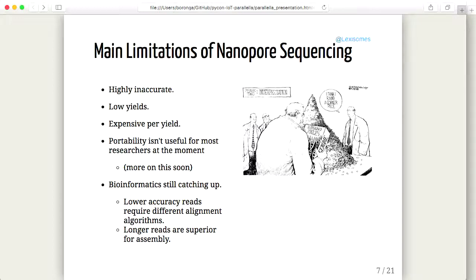I've put this picture here of a jigsaw puzzle. When it comes to assembling back a human genome, you have all these really short strings of DNA and you want to put them all together. The human genome is 3 gigabases, so it requires a lot of RAM and a lot of CPU power to put this all back together. But the MinION provides you long reads, so it's like having bigger jigsaw pieces, but they're a bit blurrier. So together with Illumina, you can be friends and have a decent quality genome.